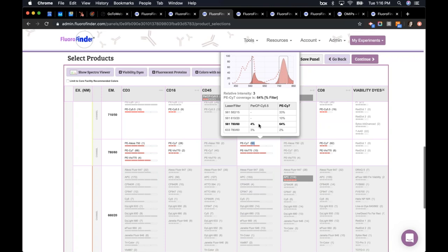I also see another column for PerCP-Cy5.5, which I already selected, because that fluorochrome affects some of the same channels that PE-Cy7 is affecting. In this case, PE-Cy7 is at 64% and PerCP-Cy5.5 is at 4% in that overlapping channel — not a big problem, easily compensated. But if you had two fluorochromes at 64% and 50%, that's something to think carefully about when choosing.